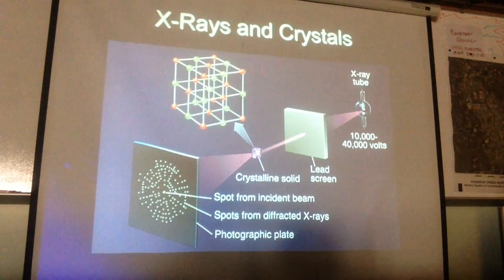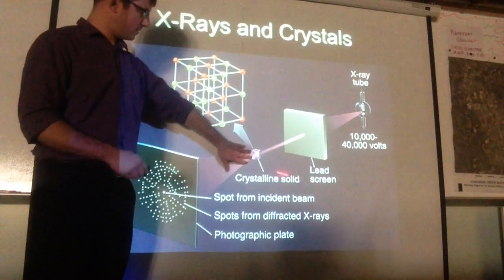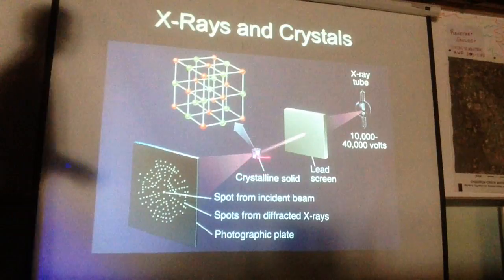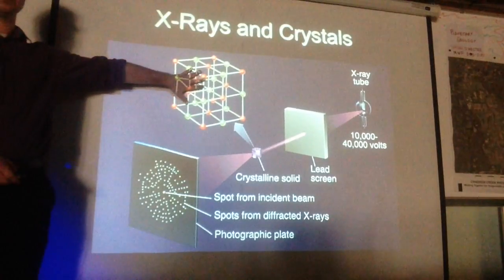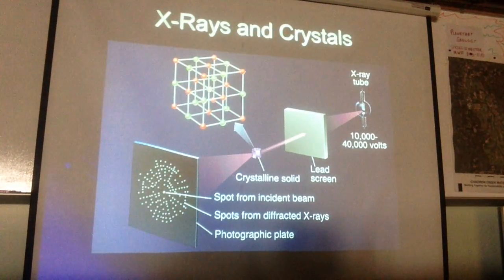Direct the X-rays. Then you have your sample, through which the X-rays are bombarding your sample, and they are then diffracted by your sample because they interact with the crystalline structure, all right?